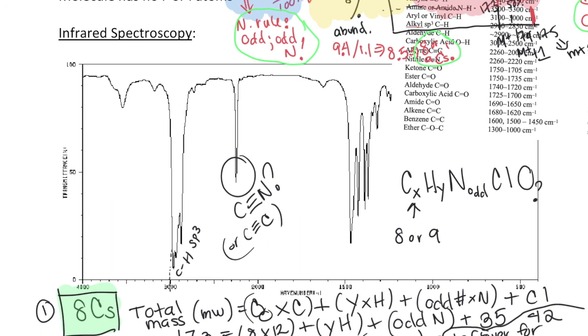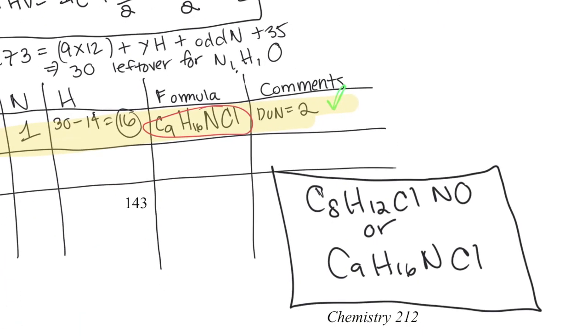So because the IR is not giving me any indication that an O is present, if I had to bet money on it, if I had to pick which one was more likely, I would say this one is more likely, because the IR doesn't give any evidence of O being present. If there was an obvious absorption that indicated some sort of carbon-oxygen bond, then I would be more likely to believe it. But it's not a guarantee. Like I said, IR you have to take qualitatively.